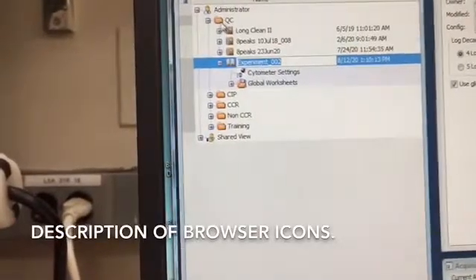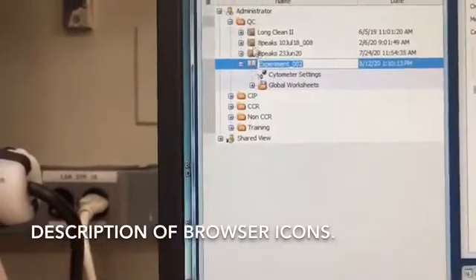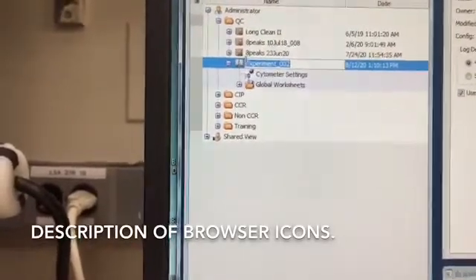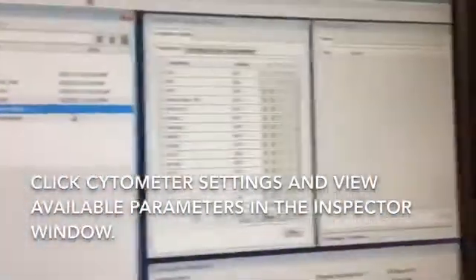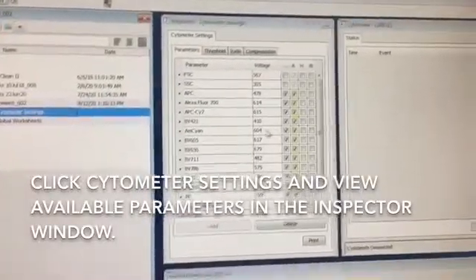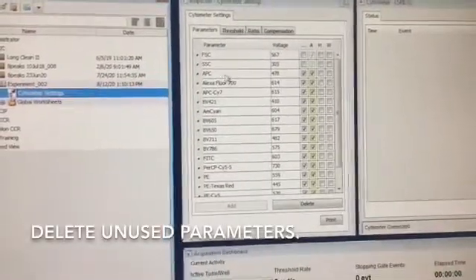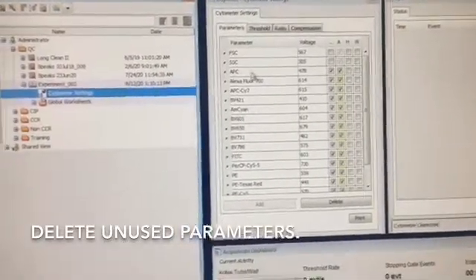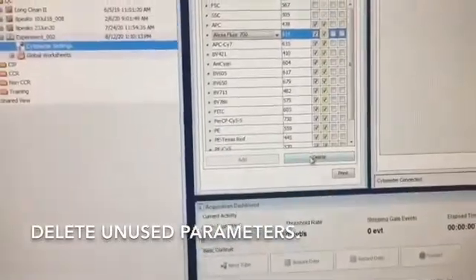You'll notice that folders have a clear icon, while each experiment looks like a file cabinet — or maybe a book — and when it's open, it looks like an open book, so that's how you know whether your experiment is open. The first thing I like to do is click on Cytometer Settings. In the next window over, called the Inspector, you'll see all the different parameters available to you. At this point, I like to delete all the parameters I'm not using. On this machine, it's a four-laser machine with 16 different channels — we're not going to use them all. So if you're using FITC and APC, you would select each unused one and click Delete.